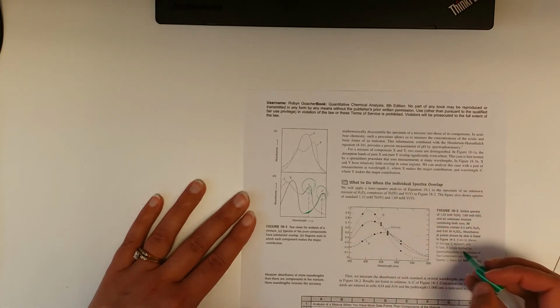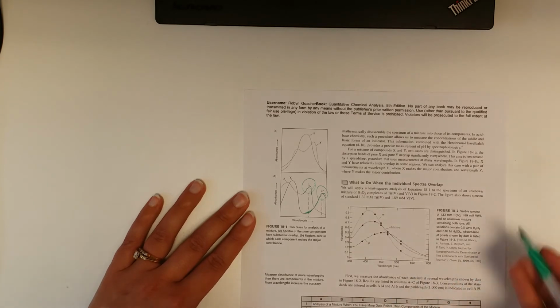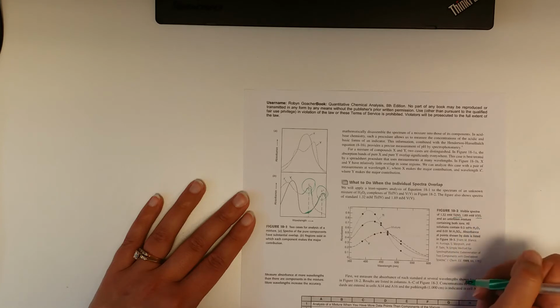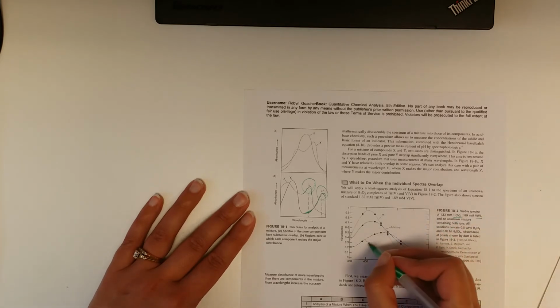Here's the example from the book. I have titanium and vanadium mixed together. Vanadium looks like this.